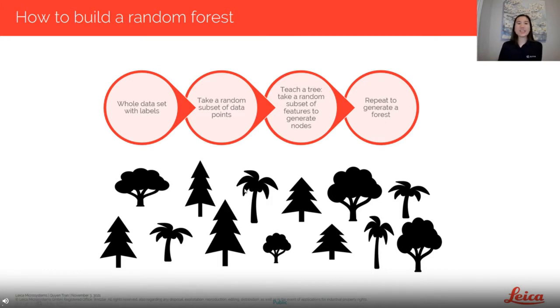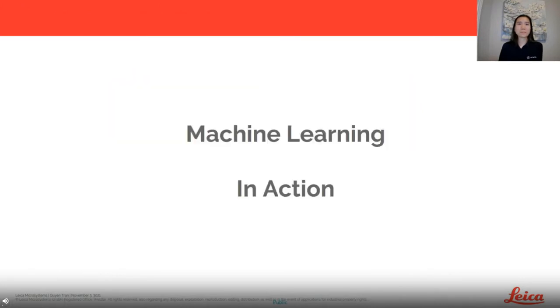So you can see here where the name and the terminology comes from, right? You're creating a forest of decision trees that are randomly created, hence the name, the random forest algorithm. That's my easy way to think about this and an easy way to remember this algorithm.